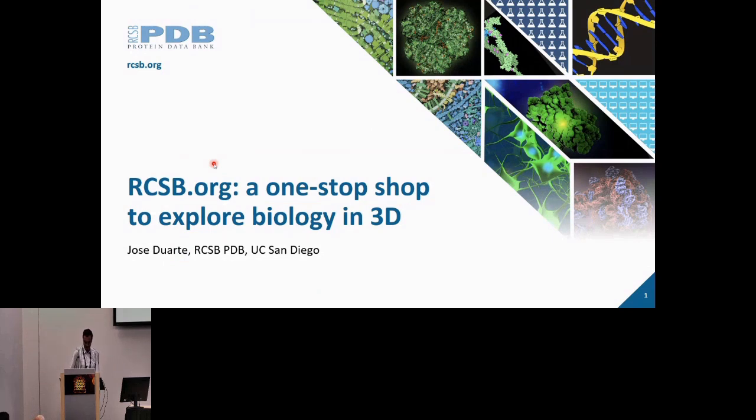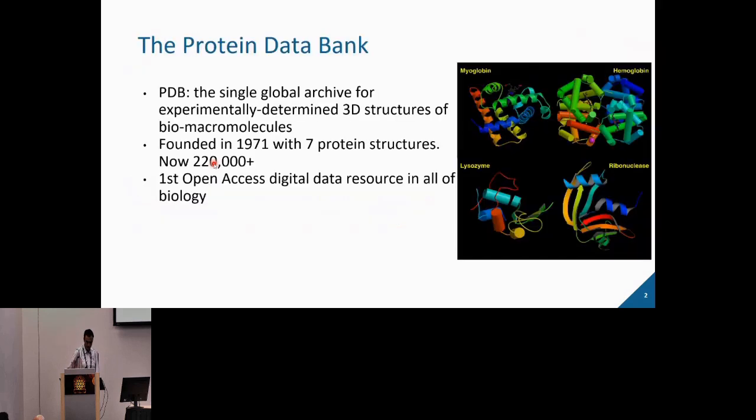So yeah, I am Jose Duarte from RCSB Protein Data Bank in UCSD. And I'm going to talk about RCSB.org, which I suppose this audience knows quite well, but anyway, I'll get into some of the latest developments. First of all, some context.